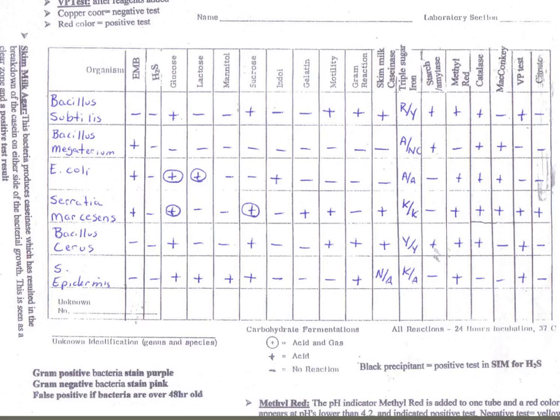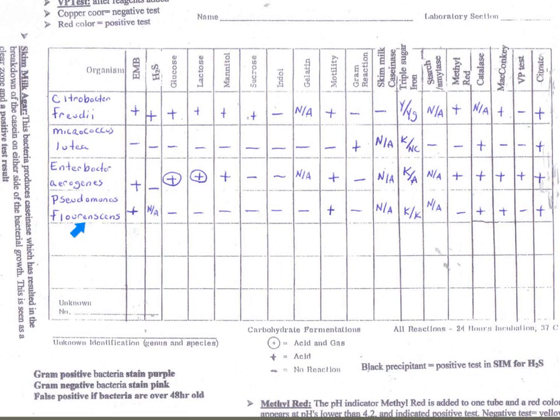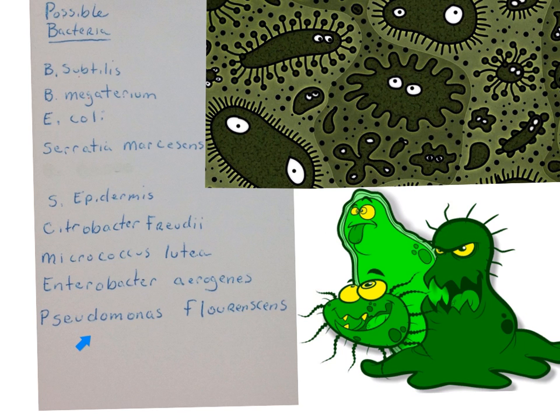Now here is the list of bacteria I typically use in my microbiology class, along with the various test agents I teach my students. And my bacteria actually takes 2 pages to list. So this is page 1 of the bacteria we work with. Here we have page 2. It's the same test, just 2 of the pages so I could continue this down. We're going to first list the possible bacteria. So here I have the possible bacteria, and I believe there's 9 there that we work with in the course of my micro class. And so the first thing I would do is I would take these 9 bacteria and I would set up my dichotomous key.